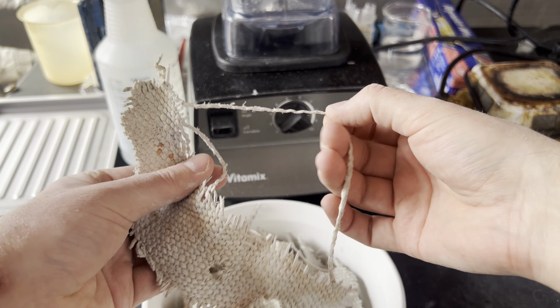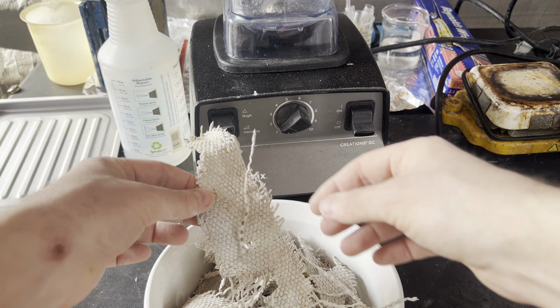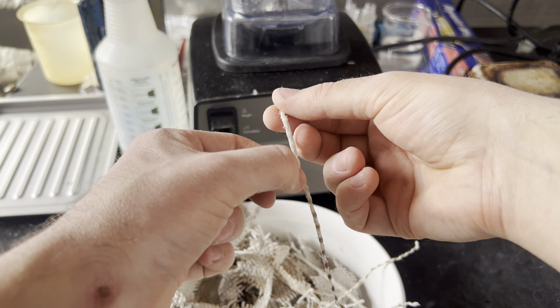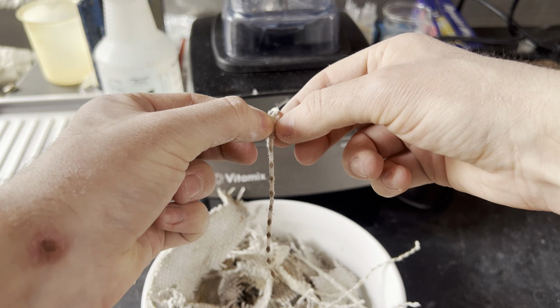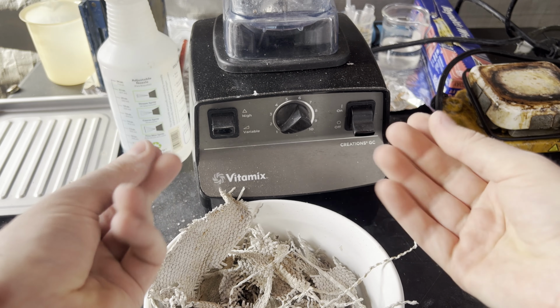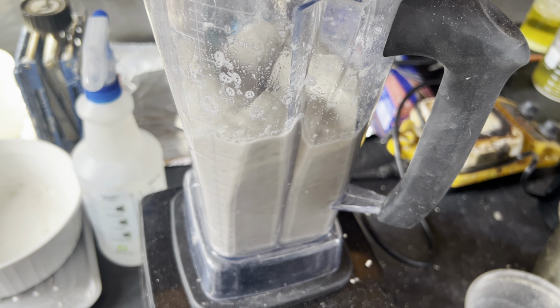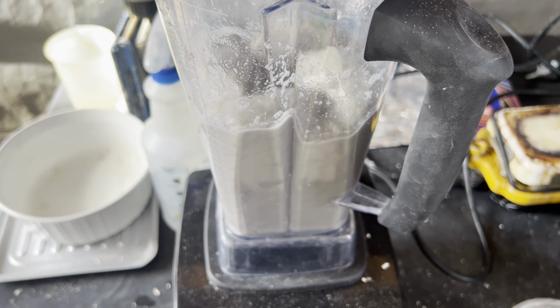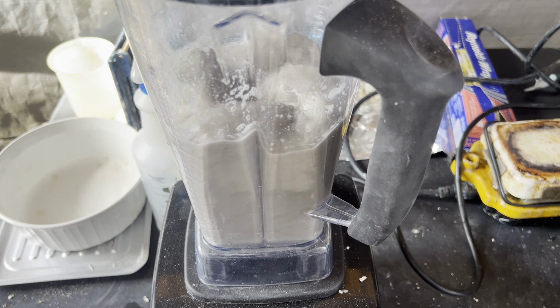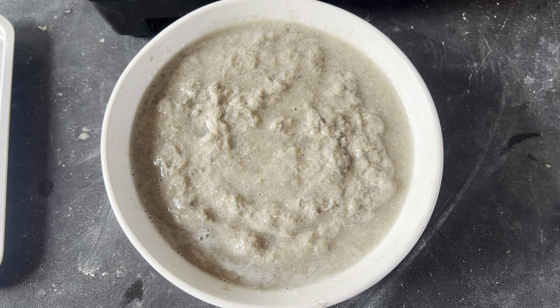You take asbestos, scrape it to a fine short down with a knife blade, boil it with hydrochloric acid, wash with water by decantation, and set aside. Then, you stretch rubber tubing over an appropriately sized funnel, plop the crucible in the opening, and put the funnel into a filter flask. A vacuum is applied, and the previously treated asbestos suspended in water is poured into the crucible. The suction creates a felt pad of asbestos in the bottom of the crucible.